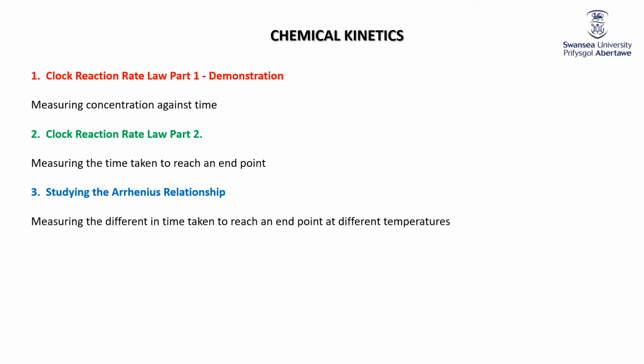So this is the video associated with the kinetics or clock reaction station that you did on our A-level days. If anyone's watching this who didn't come to the A-level days, no big deal. All we're doing is working through three aspects of a clock reaction. The first one, which will be the rest of this particular video, is a demonstration in which we show how, for the clock reaction, the concentration of the colored species changes as the reaction goes along.